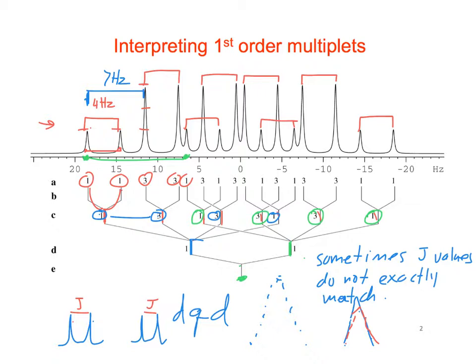Yeah. So would those 16K zero points be dummy scans on the NMR? Is that what it looks like? No, the dummy scans are scans that are done at the beginning of the experiment to allow the system to reach equilibrium. Okay, that makes sense.